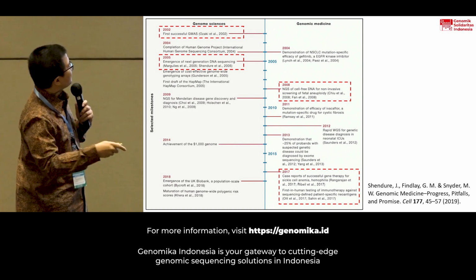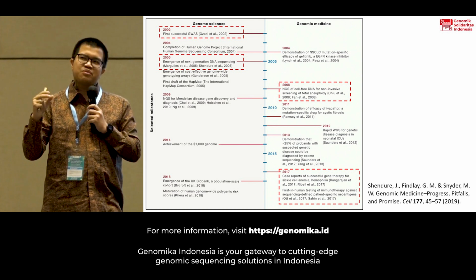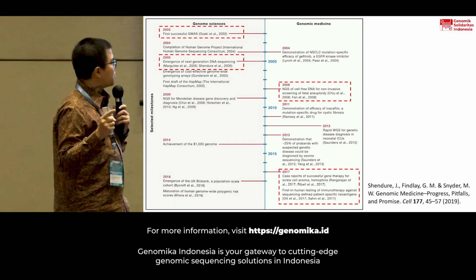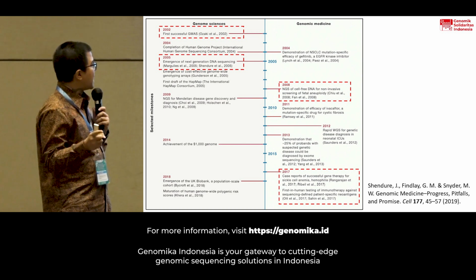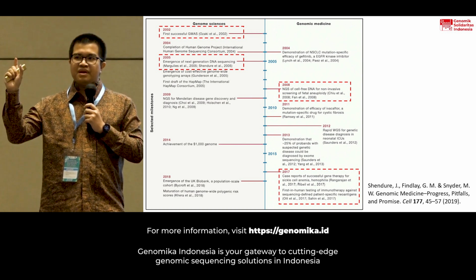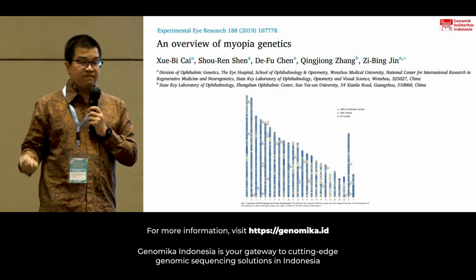Right. So in this case, all of this is part of the dream to reality that I wouldn't say was realized, but was precipitated in 2017, when there was the first case report of gene therapy for sickle cell anemia and hemophilia, and the first human testing of immunotherapy against sequencing-defined patient-specific neoantigens, which Bu Ines has pleasantly introduced to us using the term precision medicine. Now, these are the kind of things that are accelerated by next-generation sequencing and the ability to do long-read sequencing for the completeness of the reads.